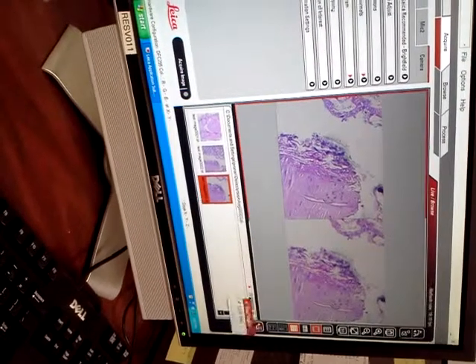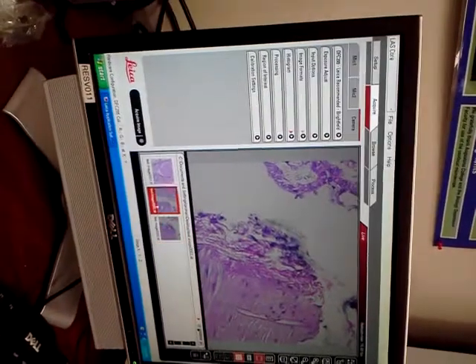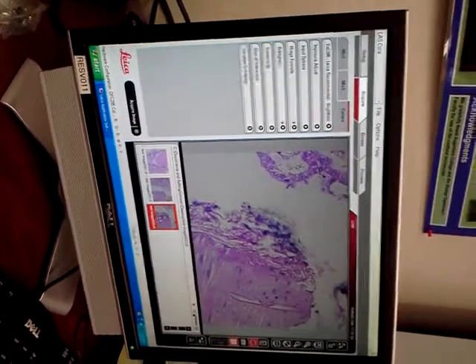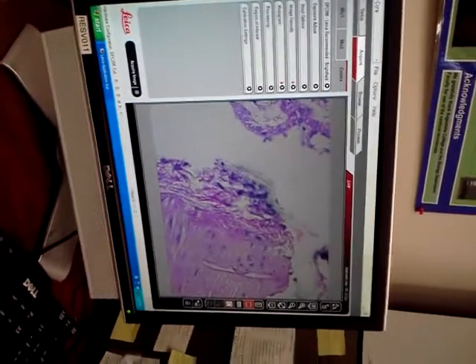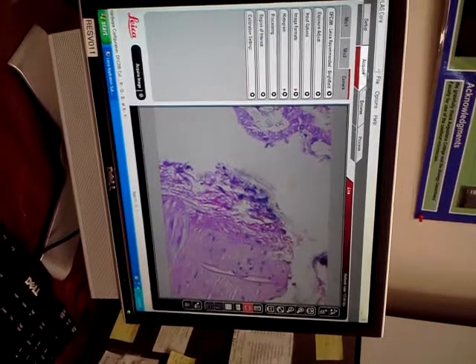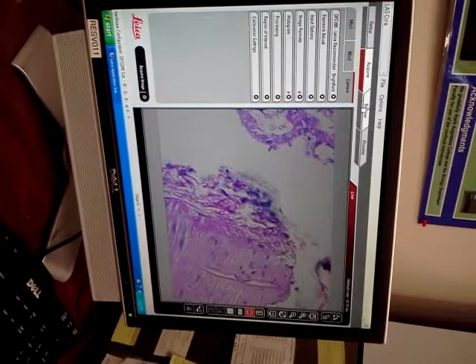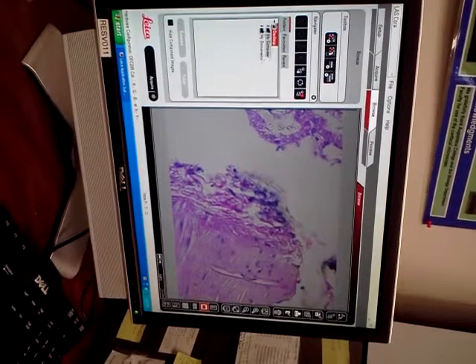So I'm gonna turn this off now. Back in Acquire. These are my images I've captured here. I'll also turn my gallery off in my live image. I like to have just my live image when I'm in Acquire. Whenever you capture an image, it's going to go from Acquire, right next door, to Browse. Within Browse, it really gives you just your computer.